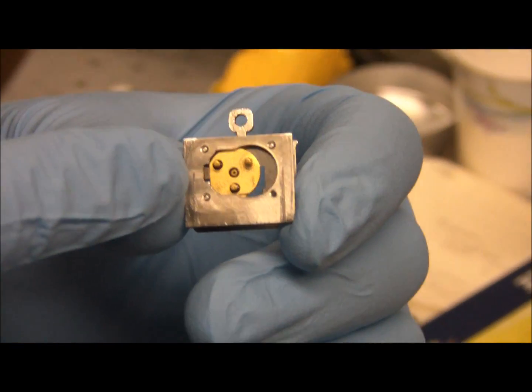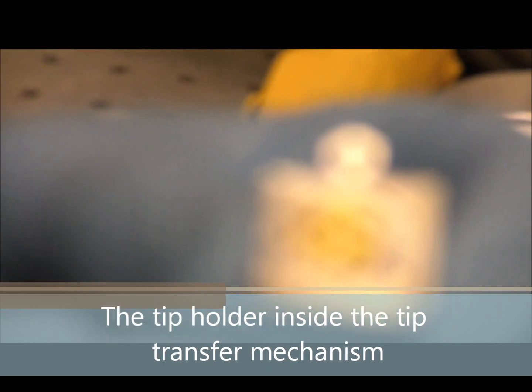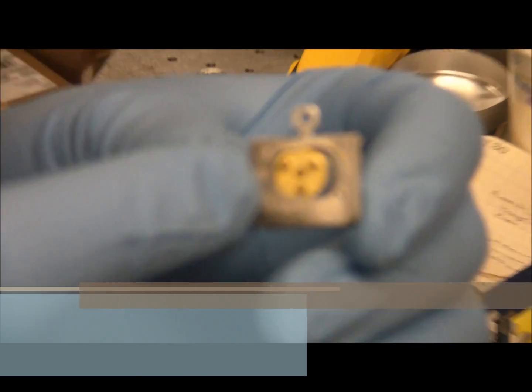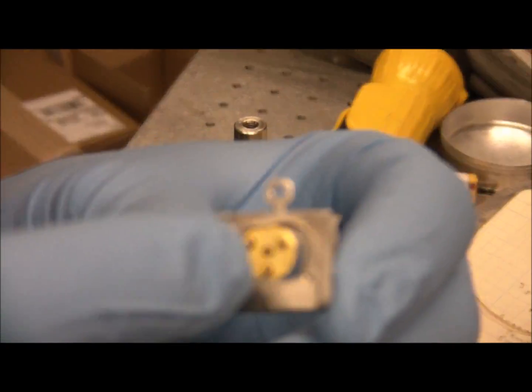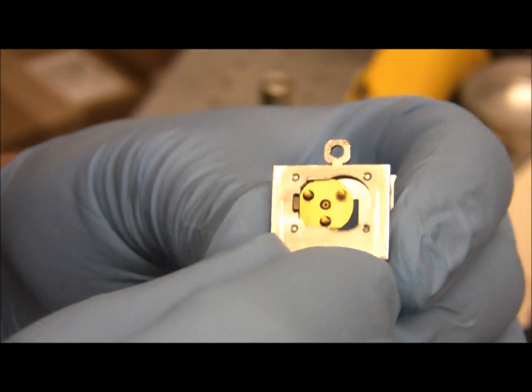The important thing to note here is that there are two tripod legs at the top and one at the bottom, and that the black ring around one of the tripod legs is on the top left and the black ring on the other tripod leg is at the bottom. Also, you can't see any tip sticking out of that center hole there.